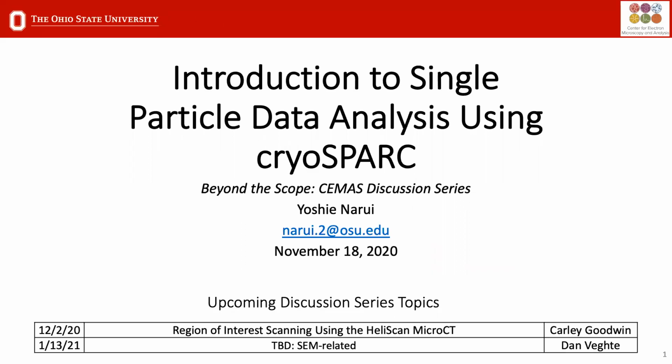Then we need to provide a gain reference, unless the data was collected gain normalized. If that's the case, then you don't need to supply the gain file. But in this case, it's not gain normalized, so I need to tell it where it is. That's the gain reference file, this MRC file, and I need to select it. If you hover over these, it sometimes provides some more information. If it's green, it means you changed it. If it's blue, it's the default number. Sometimes you do have to flip the gain reference, and that's indicated here, but that's not necessary for this one.